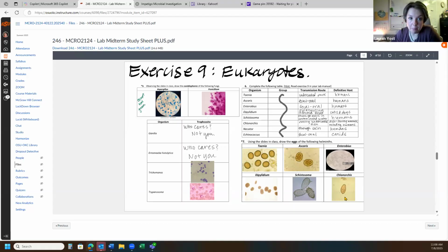Or something like that. And I'm not even going to tell you it's bacteria or anything. If it's on the 10x lens and not on the 100x with the oil, if you're seeing it on the 10x and it looks like this, that ain't a bacteria. Bacteria, we always had to use the 100x with the oil. So we had to have 1,000 times magnification in order to see our bacteria.